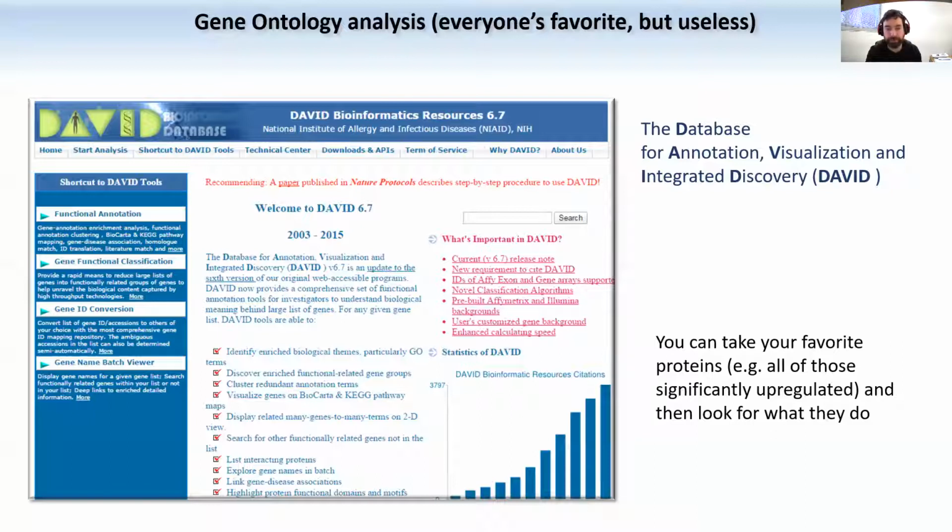So the right way is, when you look for the properties of your regulated proteins, these regulated proteins have some properties that need to be compared with the background in order to tell how unique are the properties of the regulated proteins. Now, to compare this to the background, you need to have a background that is appropriate, right? For example, I'm going to give you a quick example. If you are working with cells from muscle, right? And then you treat these muscle cells with a certain drug that activates, I don't know, some kinase receptor, right? So you're going to have some proteins that are being regulated by your stimulation, and then you input these proteins into one of these gene ontology tools, like for example, DAVID.